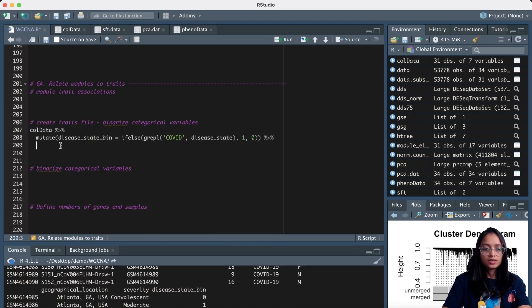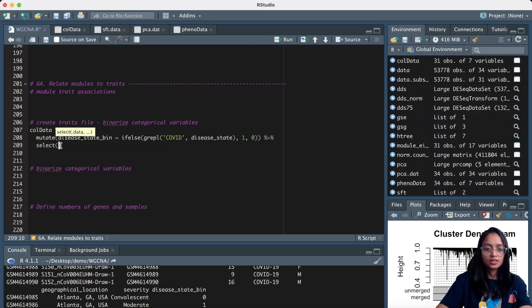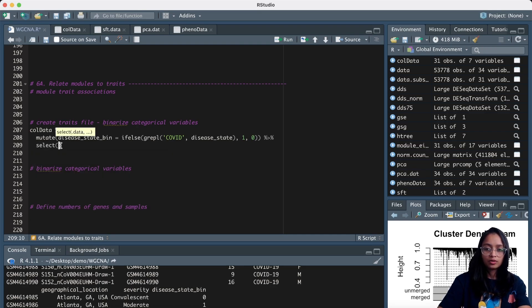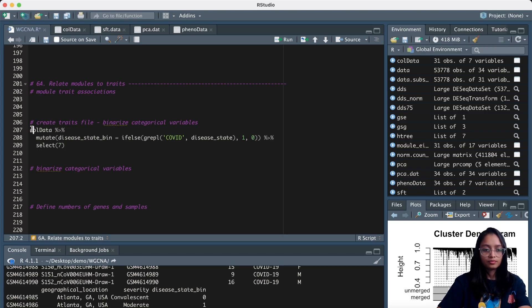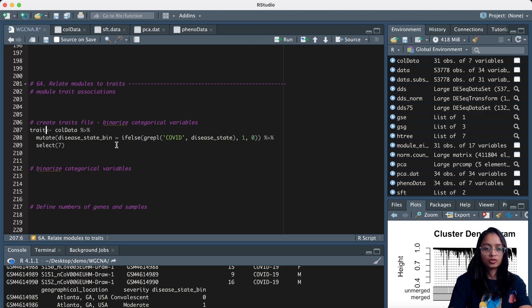Now let us get only the columns that are of interest. I'm going to select the last column, which is column number seven, and save this to a variable called traits.